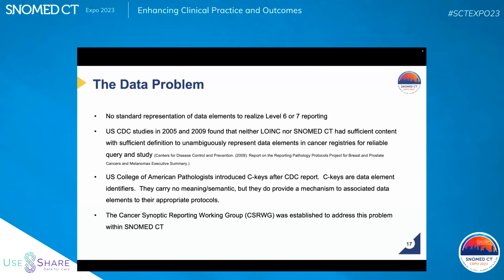Every data element has a number, and it's unique to the worksheet it's on. So in essence, if you have the giant decoder ring, you can figure out which data the number pertains to. It's not computable. It's not going to tell you how one thing relates to another, but it certainly was a start.